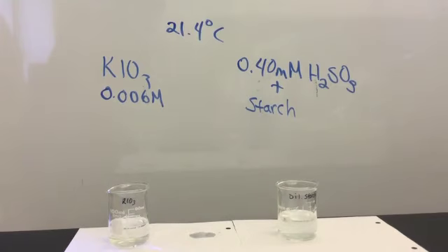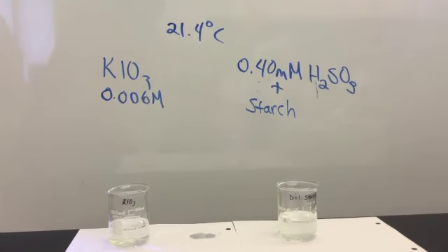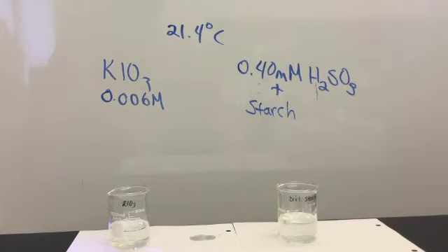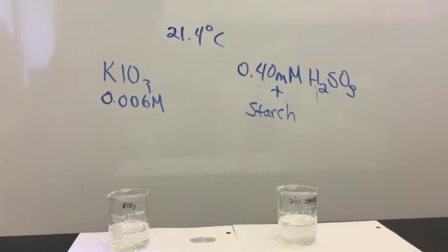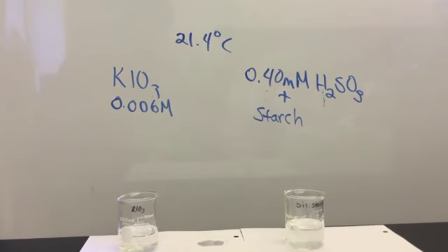We can also adjust the concentration of the sulfurous acid and starch solution. In this case, the concentration is higher at 0.4 millimolar. The concentration of potassium iodate is back to the original concentration.